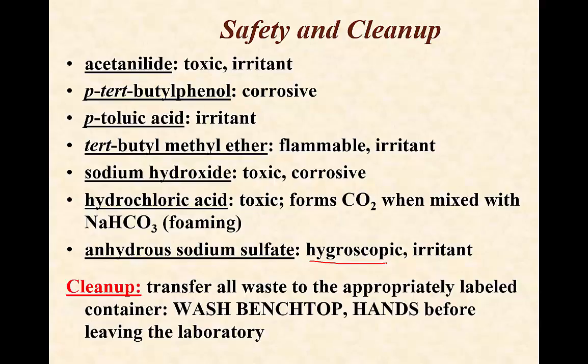The problem is it dries water out of anything it touches. If it lands on the counter, it absorbs moisture out of the air, it turns into a puddle, which is then a corrosive puddle. It will damage your skin if you touch it. If you happen to get it on your skin, guess what? It pulls the moisture right out of your skin. So it acts very much as an irritant in that way. So just handle that carefully. When you're finished, you transfer all the waste to appropriately labeled containers. Be sure to wash down the bench top, wash your hands thoroughly before you leave. Make sure there's no traces of any of these compounds on you before you go.